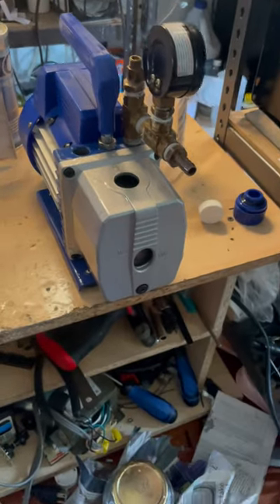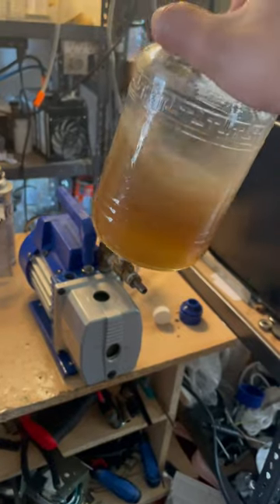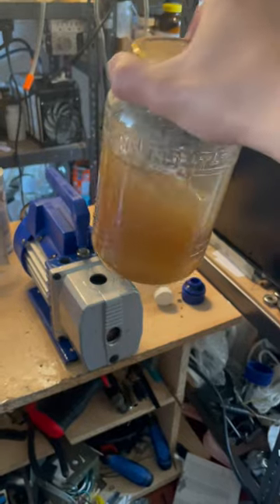I'm giving my vacuum pump a little oil change, and it's looking a lot better actually. Believe it or not, this is actually decent — this is just a tiny bit of rust and a tiny bit of water.